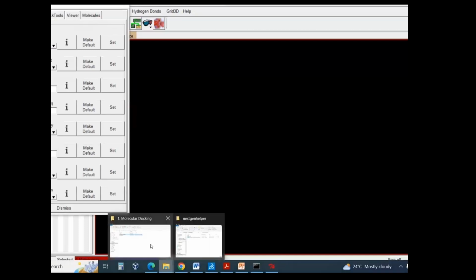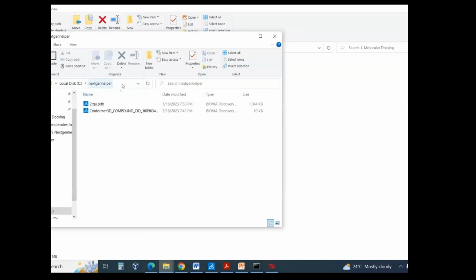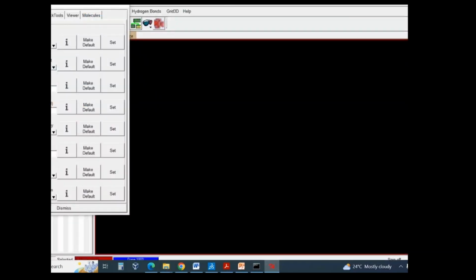So basically, what you need to do is go to your working directory. I can simply copy this path here, right? So this is your working directory, if you remember, in the C drive. So simply click here and copy this path, and go to the setup directory section of this window and simply put the path here.